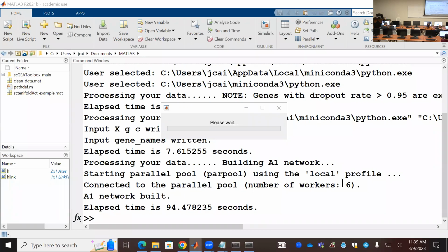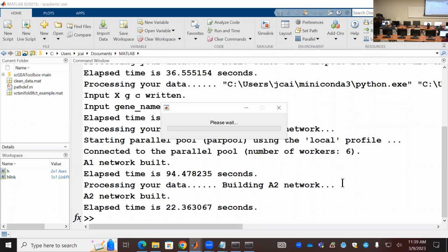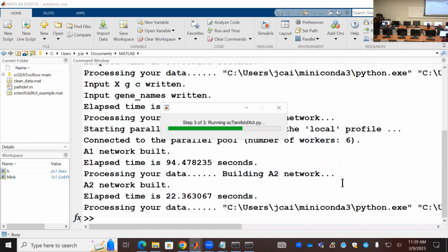After that, this place allows you to select not 2000, but you can say 500. But for now, you can select 2000. We'll only finish 2000. There's too many. What is this actually? We call it highly variable genes. We will discuss that next. You need a new version of this package.